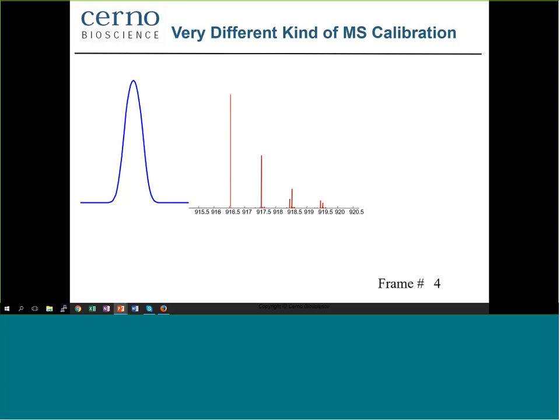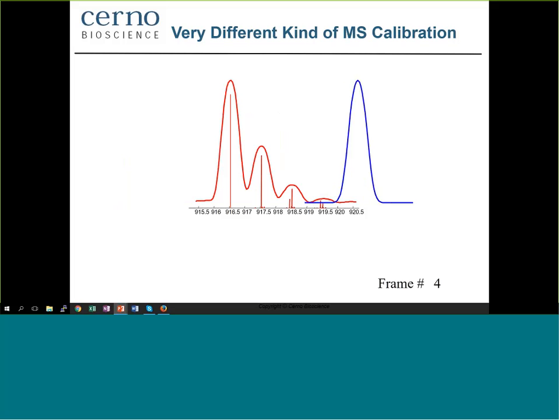In addition, we know the natural abundance of the isotopes, and from this information, we can accurately calculate the theoretical spectrum. Note that the theoretical spectrum has infinite resolution here, and the contributions of the different isotopes at n+1, n+2, etc. are very apparent. However, our real measurement does not have infinite resolution. A real spectrometer has finite resolution. But we know the approximate resolution from our previous line shape estimation. So what we do is very simple. We convolve the defined peak shape function with our ideal theoretical function. So what we have now is a mathematically ideal theoretical mass spectrum that's based on first principles.